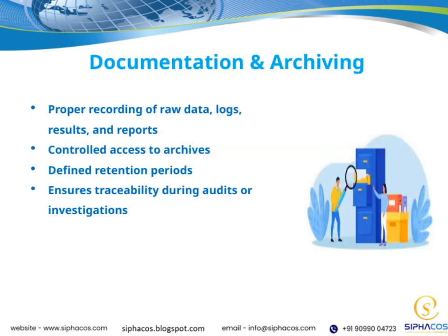When it comes to documentation and archiving, proper recording of raw data, logs, results, and reports is absolutely essential. This means making sure we accurately capture and store all the critical information generated during our processes. Controlled access to archives is equally important.